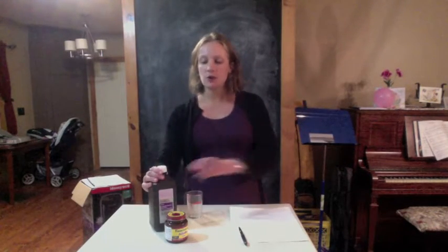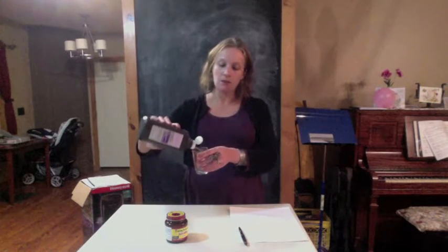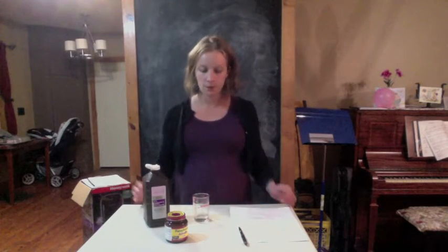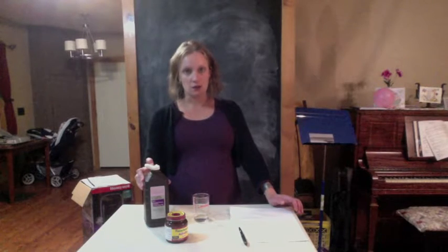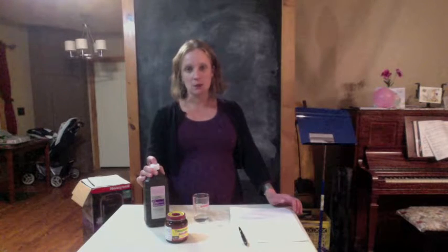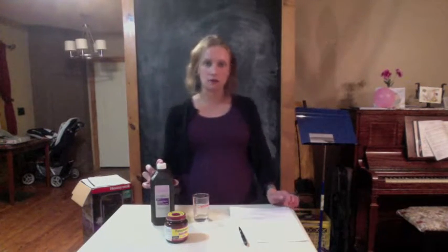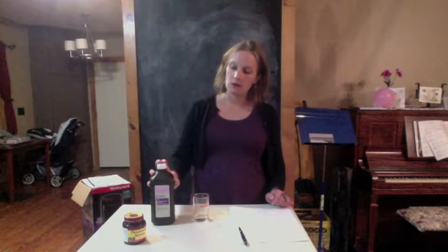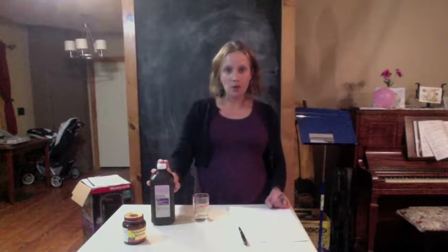Now hydrogen peroxide, H2O2, breaks down spontaneously on its own. If I were to leave this overnight or longer, it would break down into water and oxygen, which wouldn't have many of the properties that it has when it's in the form of hydrogen peroxide, which can be used as a disinfecting agent or a cleaning solution. Oftentimes it is used as a disinfectant, even in hospitals, so it's very important to store it properly.